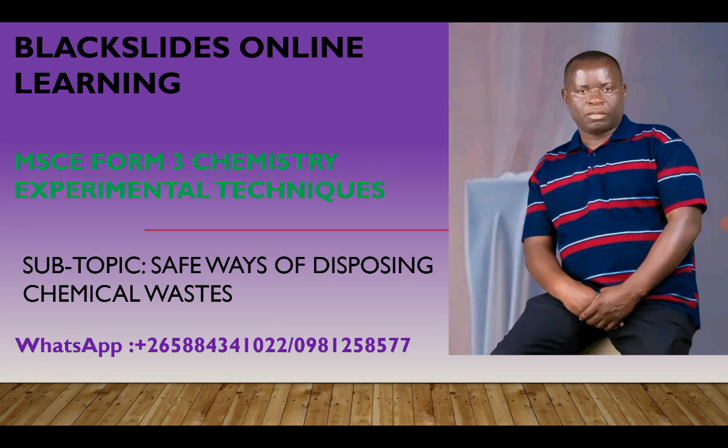The subjects are physics, chemistry, biology, and mathematics. So we meet now for Form 3 chemistry topic, which is called experimental techniques, and in particular we are looking at a subtopic called the safe ways of disposing chemical waste. This is lesson number 2 of the topic. In lesson number 1, we looked at the definition of a chemical waste.